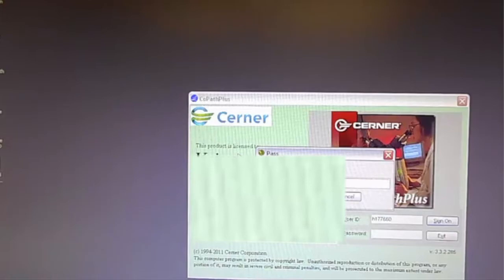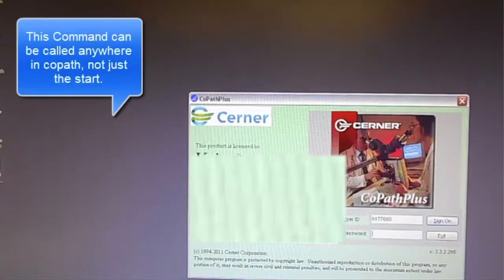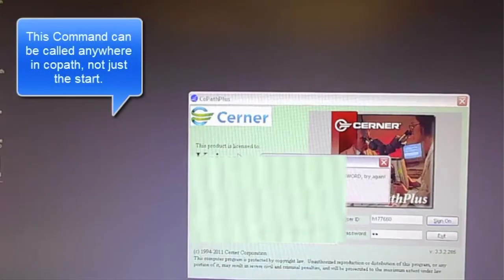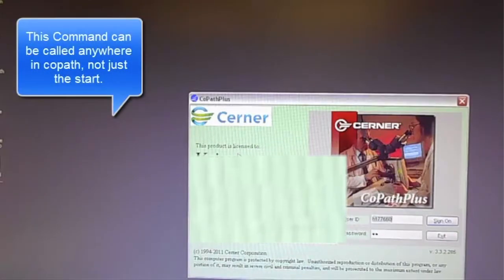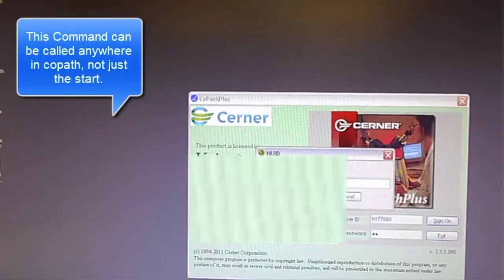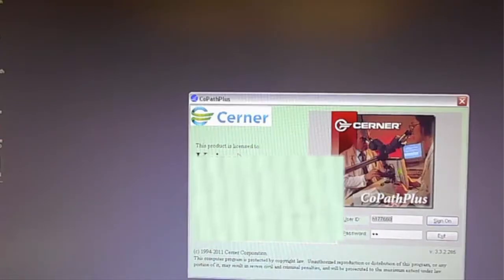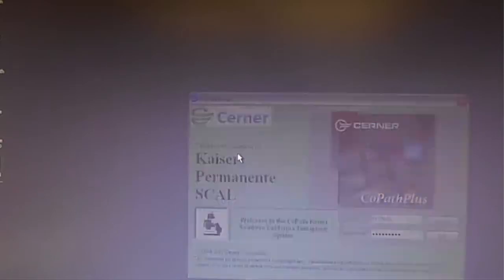If you look, my password is secured by putting bars in there, so you can't read what the password is. I entered an incorrect password there in order to show how Dragon will go back and ask you for your NUID and password again.